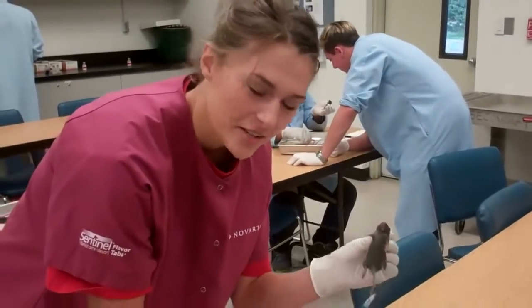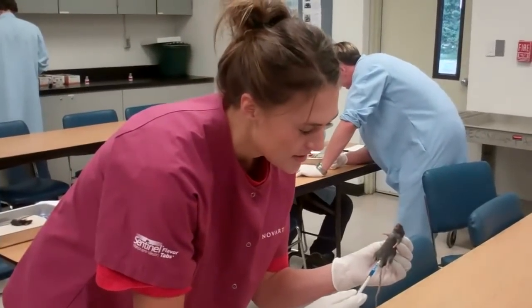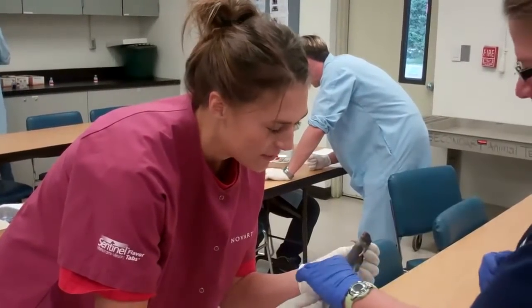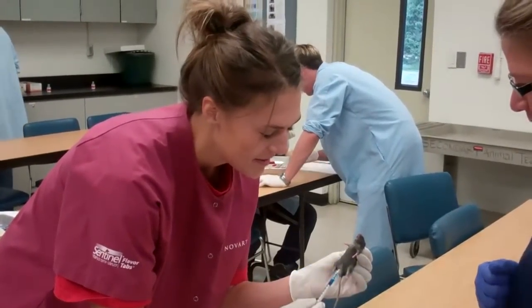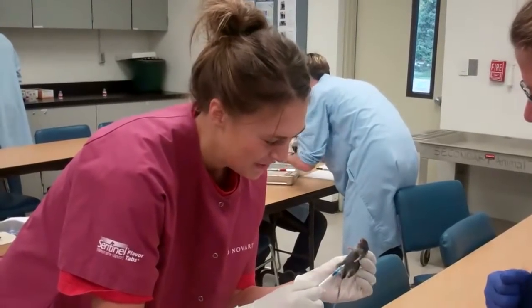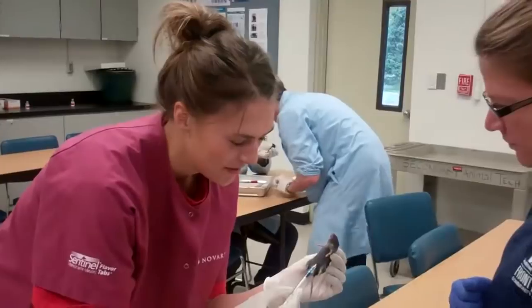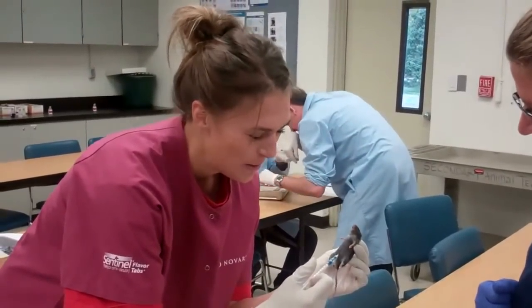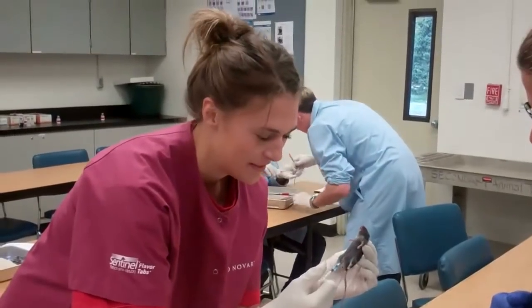So first, you're holding on the scruff, and then you're going to slightly pull up the skin. Tara is going to assist me here, because I'm a learner. A little bit more of an angle — you want to go in underneath the skin. There you go. Then you kind of pull it out, you're going to aspirate. Put the blue stuff in, pull it out.